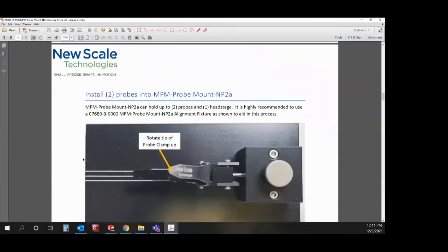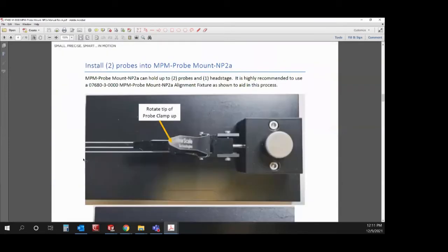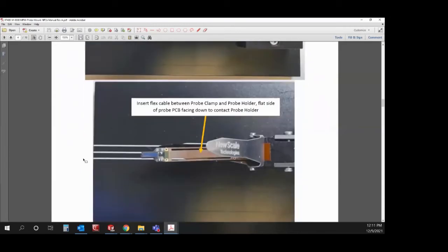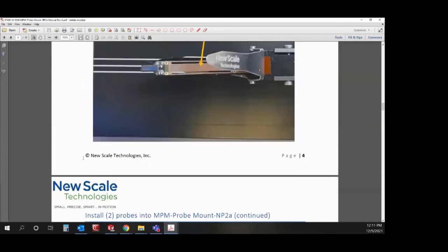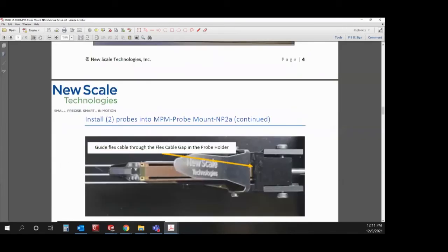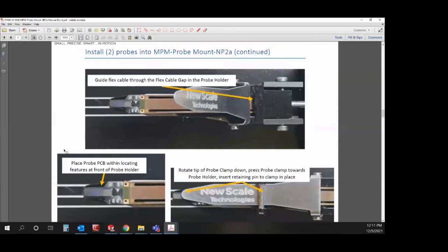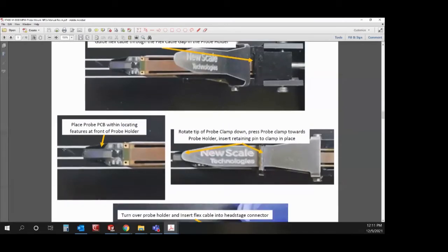For two probes you would follow the same procedure, but for the first probe you would guide the flex cable through the gap in the back before rotating the probe mount around in our alignment fixture to install on the other side.